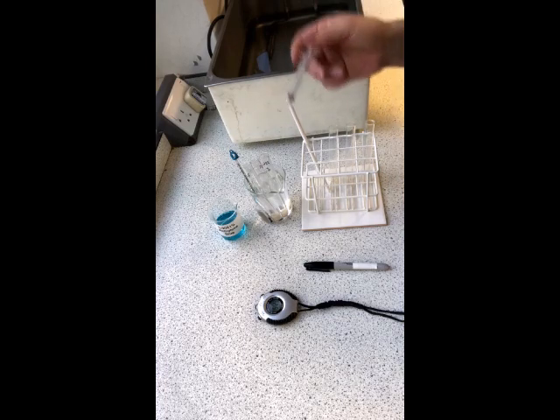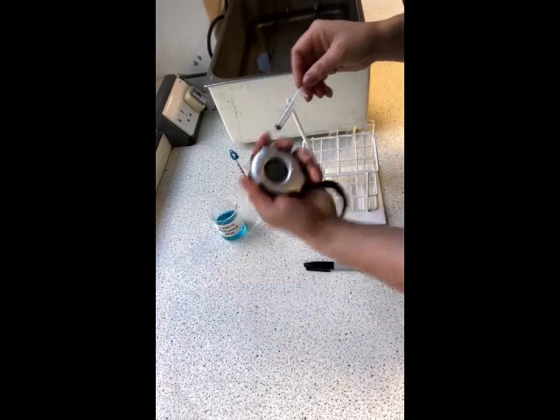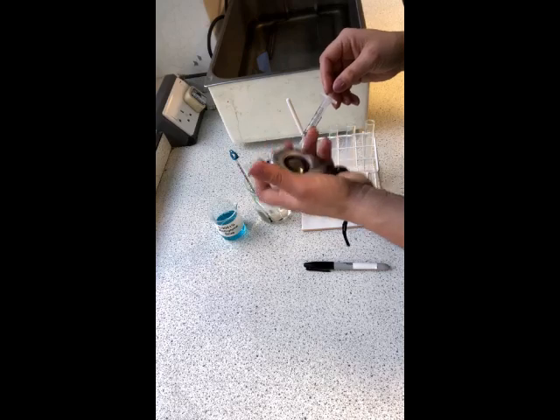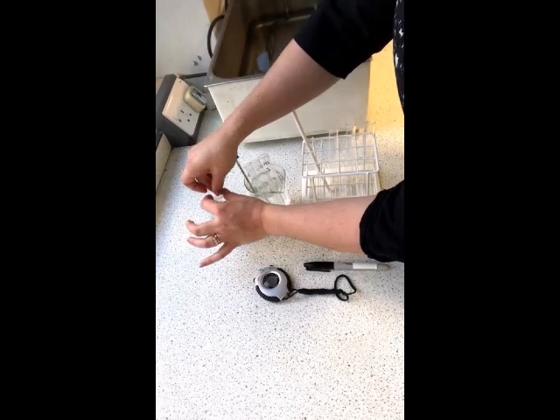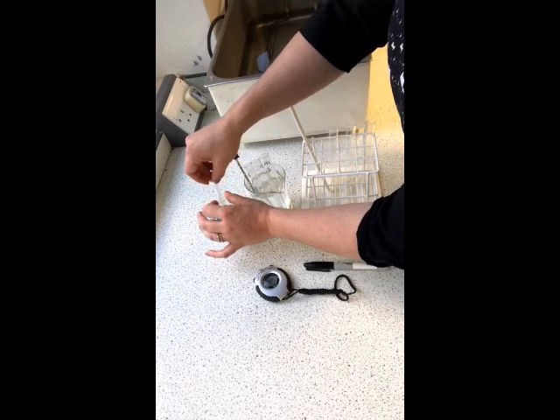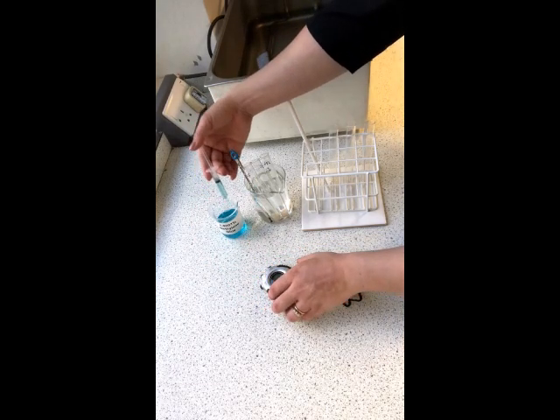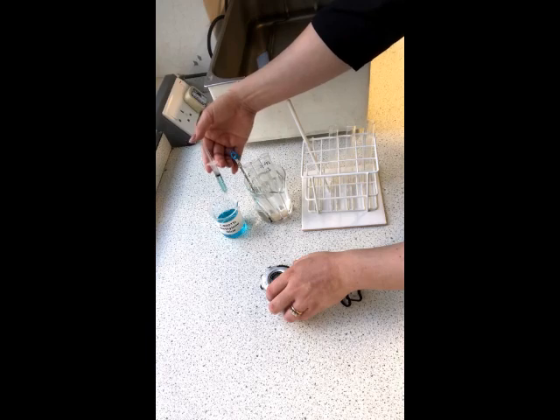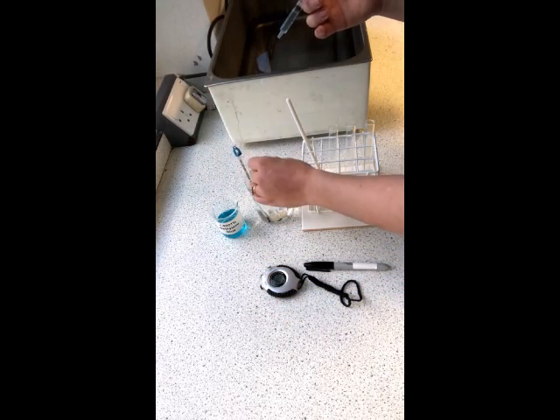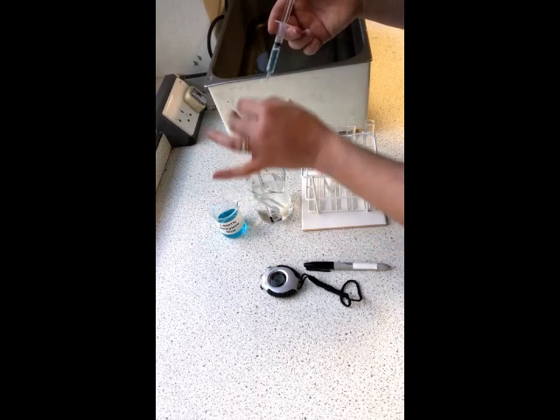Okay, so we'll do it one at a time because I don't have the speed to do it all at once, and then we will record the time taken. So make sure that your timer is reset. Okay, we're going to measure out our 2. Okay, make sure we haven't got any bits and bobs. Okay, and then we are going to add it in to tube number 1.